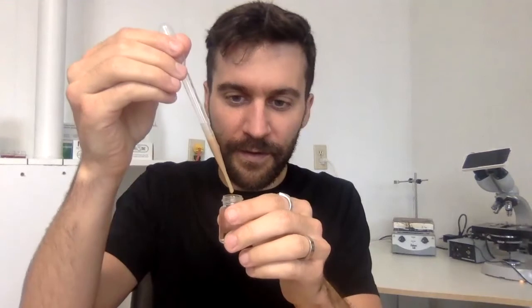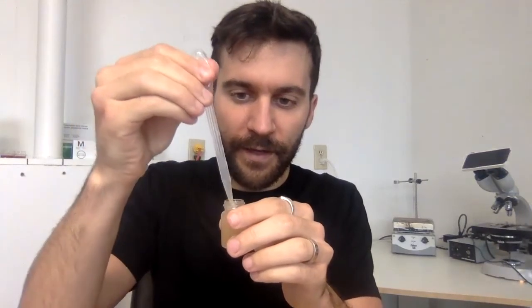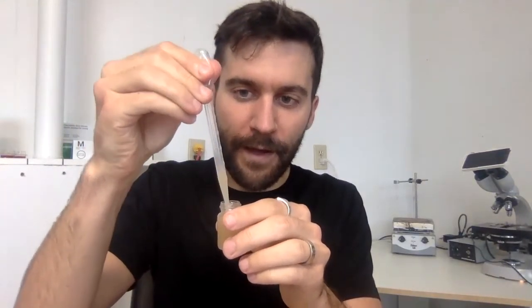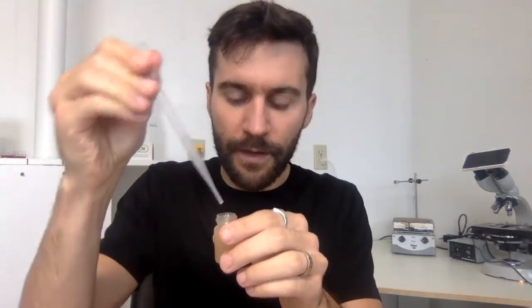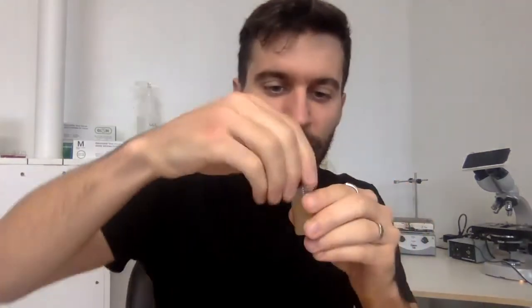And we add a milliliter to this. I like to pipette up and down to get any residual yeast. Okay, great. Just give it a quick shake and do the same thing.